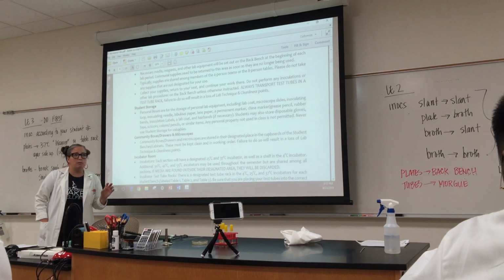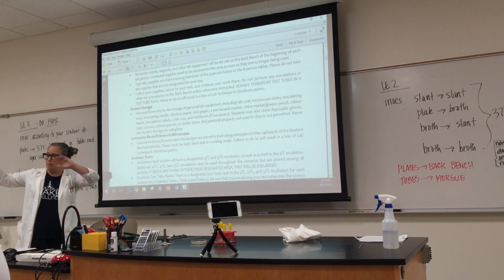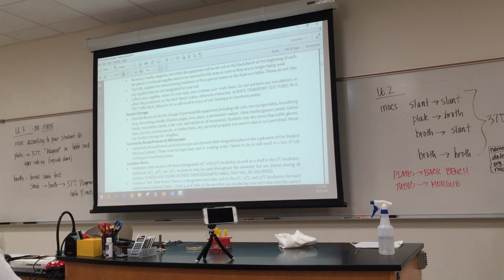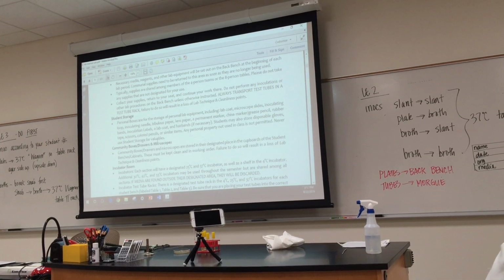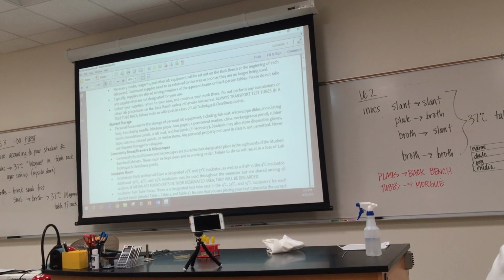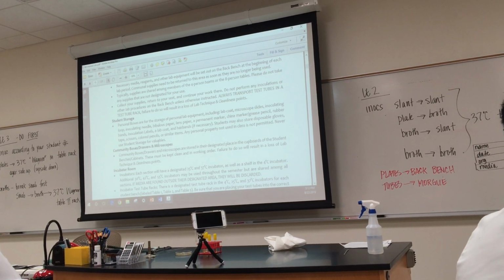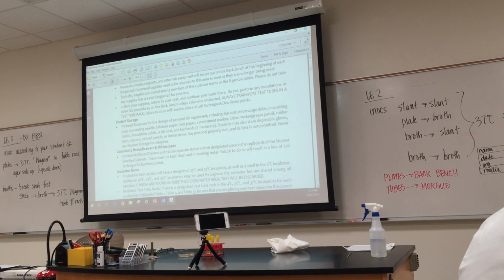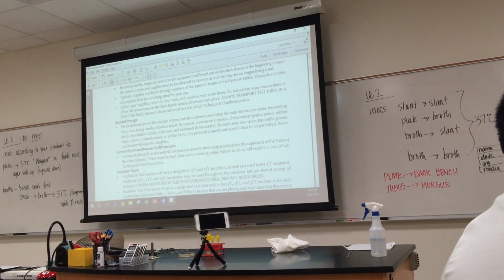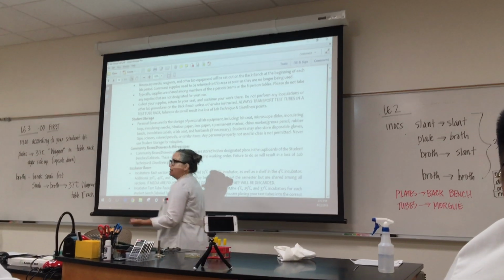And then you have either a community drawer or a community drawer and box. So table 3 and table 2, you guys have just a drawer. This is our ADA compliant. You might have noticed it's a little shorter, so that someone, if they were in a wheelchair, could access this table. But that means your drawer is really short and it won't fit everything. So you guys, in addition to what's in your drawer, have these boxes. So only students 1 through 8 need to worry about this, but that's where lots of your communal supplies are. So that would be your stains, your Bunsen burner, which is going to be used today, your striker, which is going to be used today, and they go back into those areas.